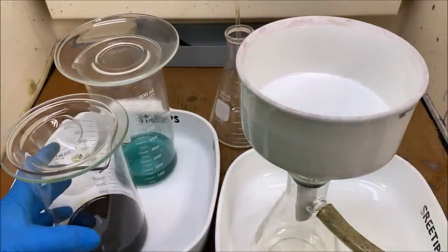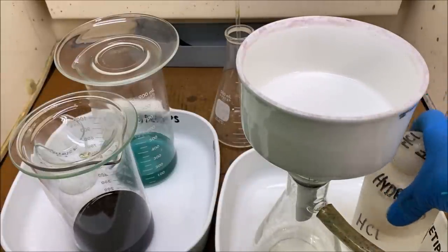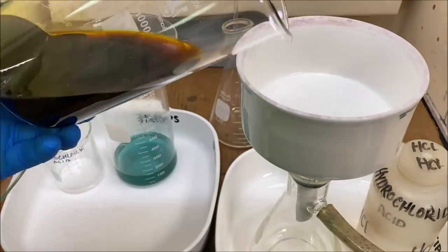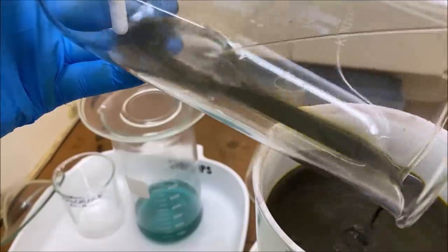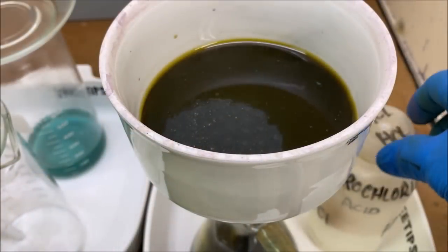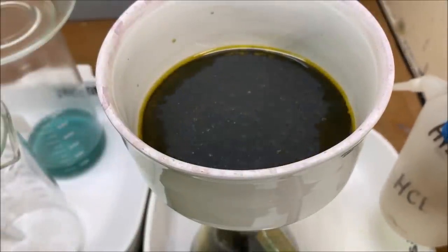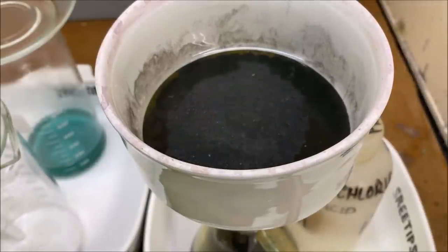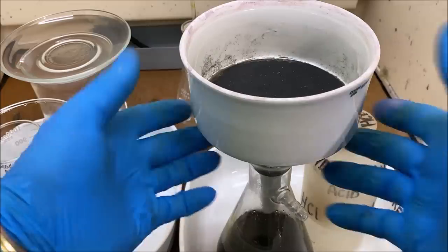Solution's been allowed to cool to ambient temperature. I've got a filter set up here. Now what we'll do is filter our solution. Let's get the funnel out of the way.